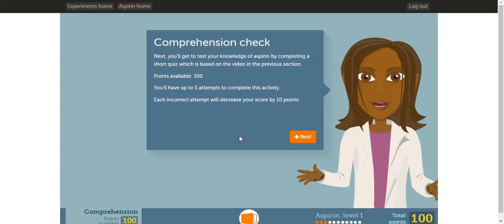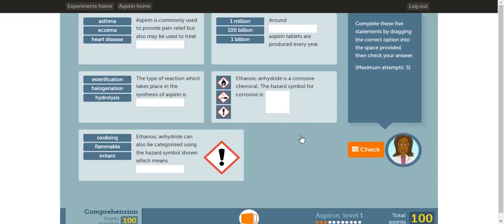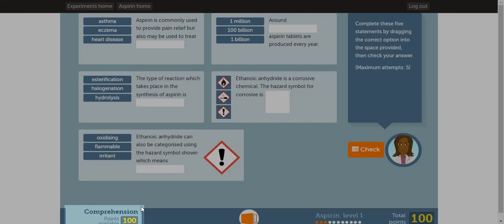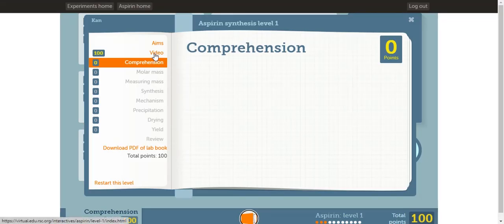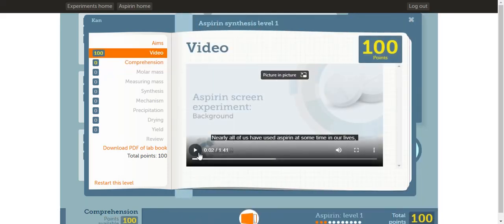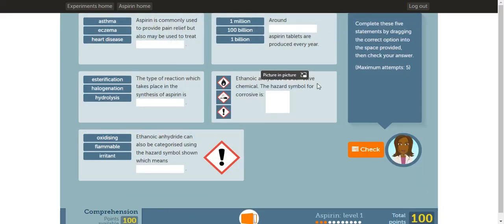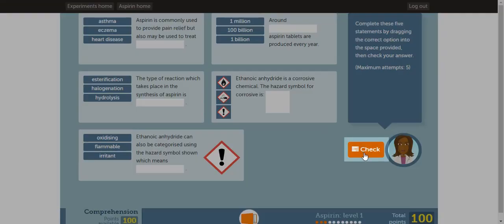The activity will be a comprehension check based off the video. This is a fill-in-the-blank activity based off the video. There are 5 questions. If you get a question wrong, you will not get the full 100 points from this activity. If you forgot about the information from the video, you can watch the video again in your lab book — click the lab book, go under video, and you can play the video again. If you do not get 100 points from this activity, you can start the lab over again. Once you complete this, click check to move on.